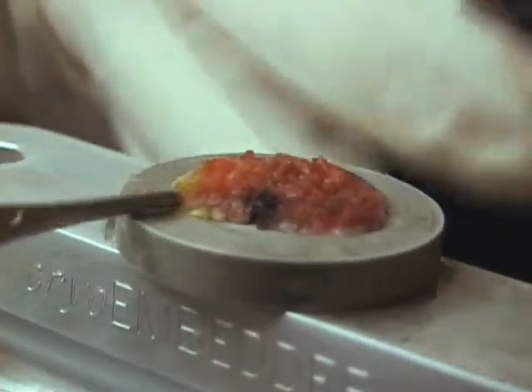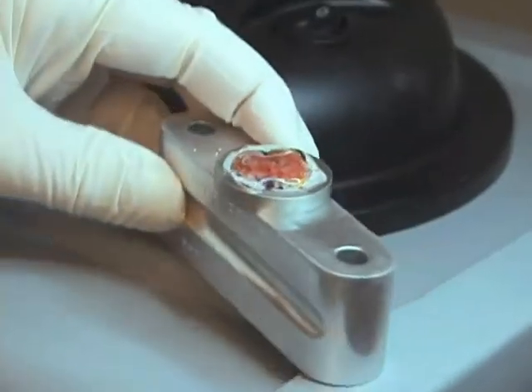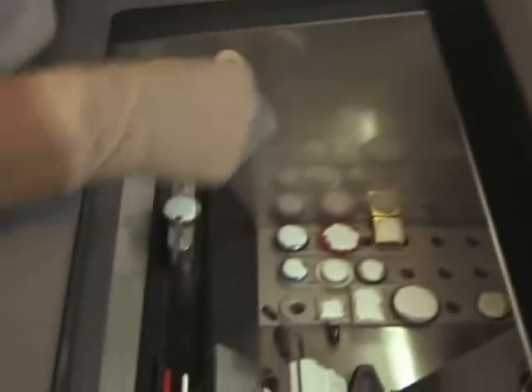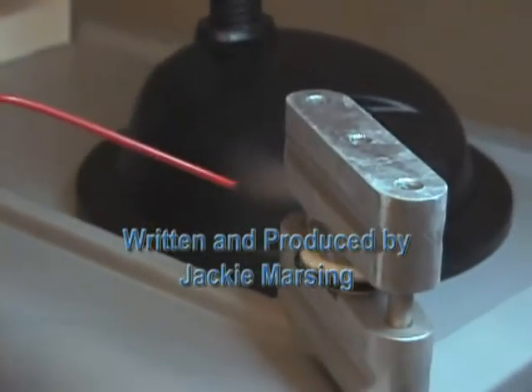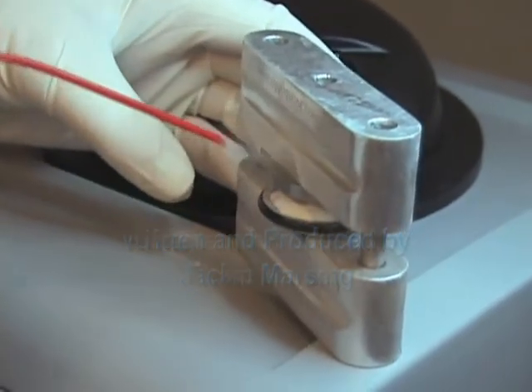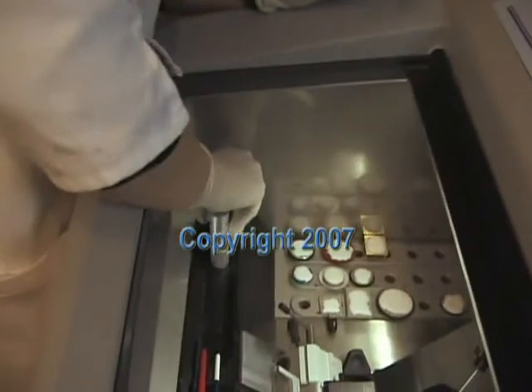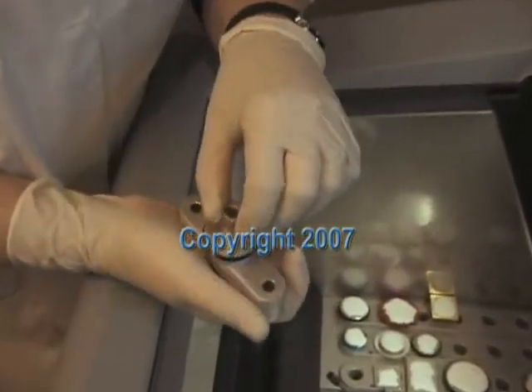Place the cutting chucks back into the holder and begin cutting this case. The cryo-embedder system is easy, fast, efficient, accurate, cost-effective, durable, and has been proven in labs and offices across this country and around the world to be a valuable instrument and tool in the processing of tissue for frozen sections. Simply said, it works.